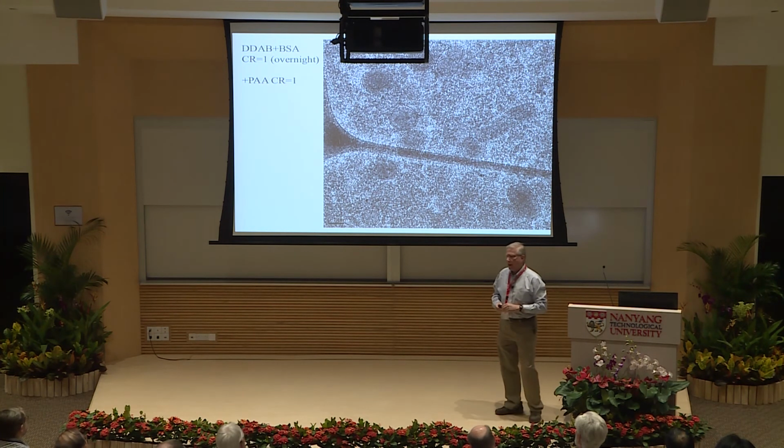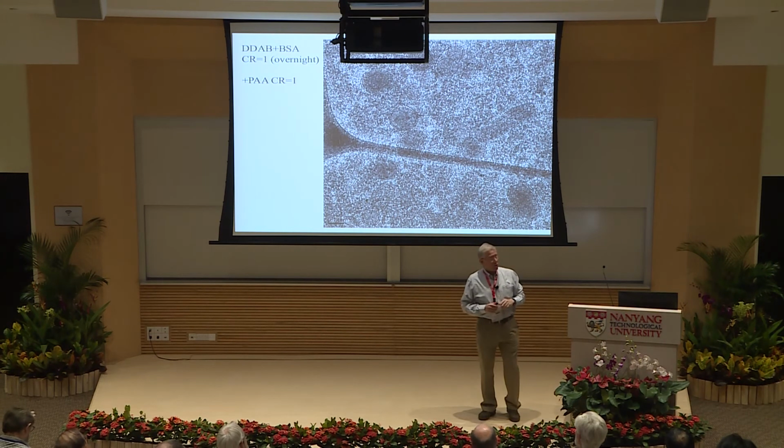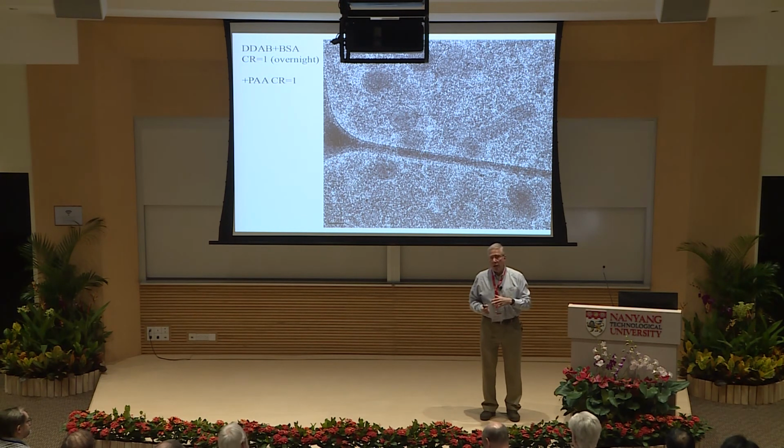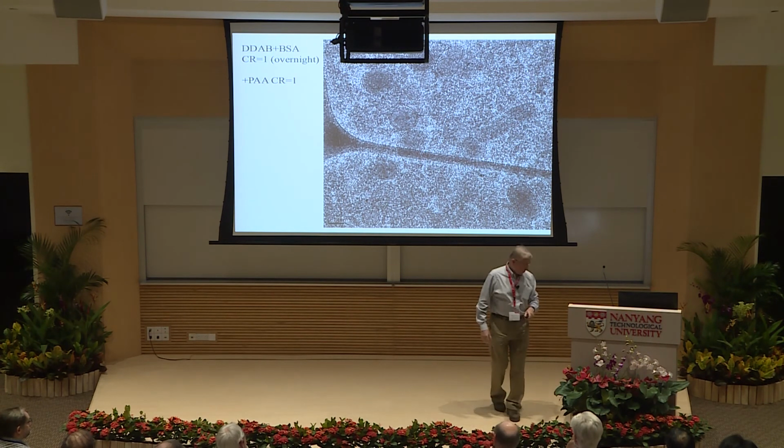Okay, so that's it for now. I hope I gave you a taste of what modern cryo-TEM can do, and the fact that you can connect the nature of your molecules to the nature of the complexes that form, or any aggregates for that matter, and to the function on the macroscopic scale. Thank you very much.